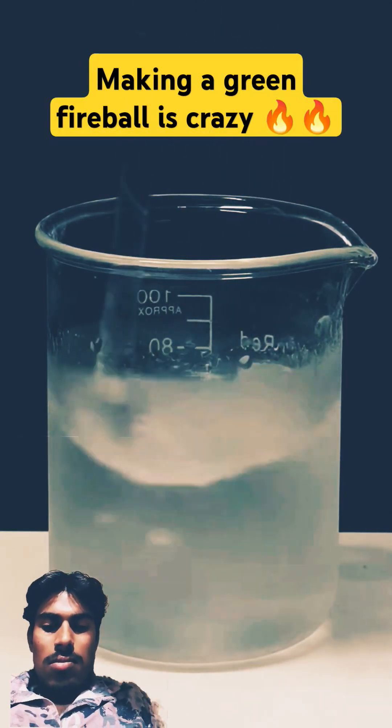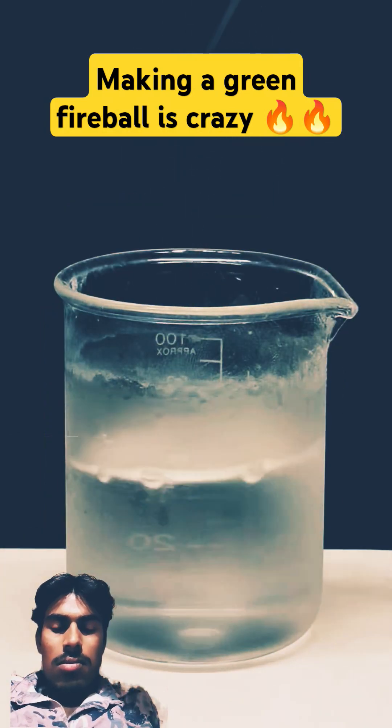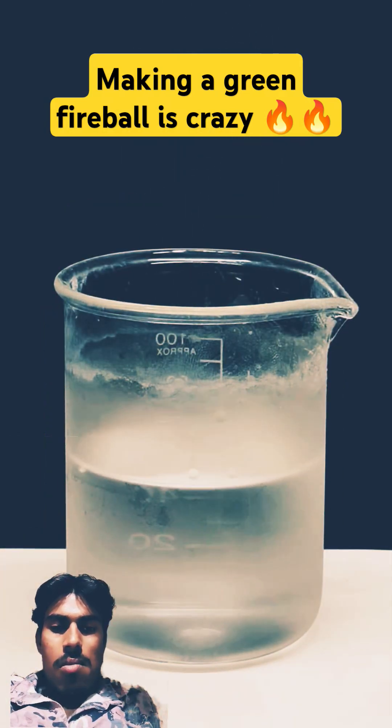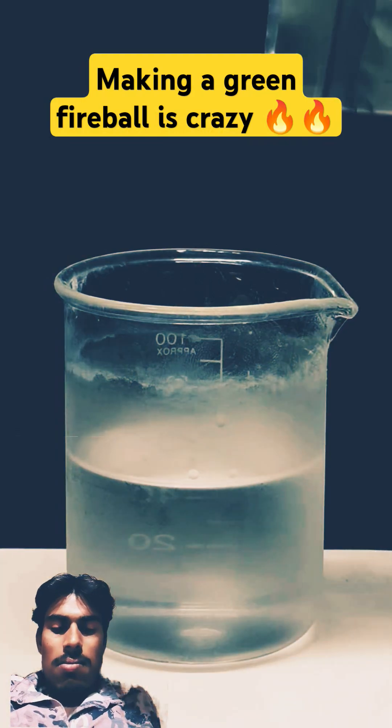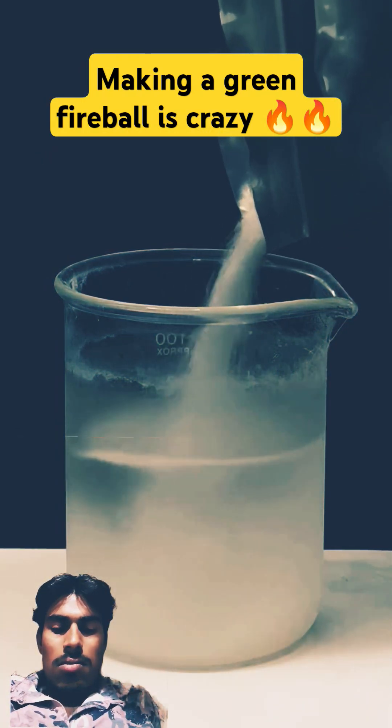This caused the methanol to cool down quite a bit, and by the time all the boric acid was gone, it was pretty cold. But either way, I can now add something called potassium polyacrylate, which is a super absorbent polymer.